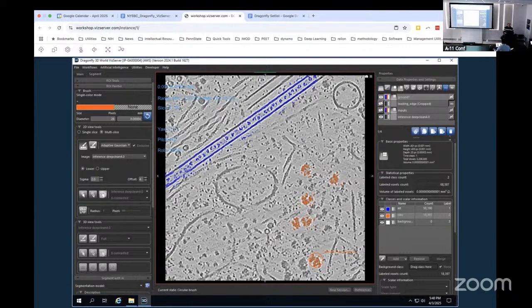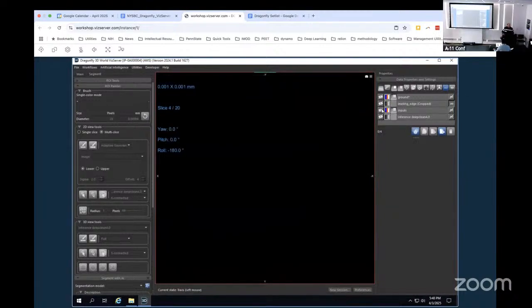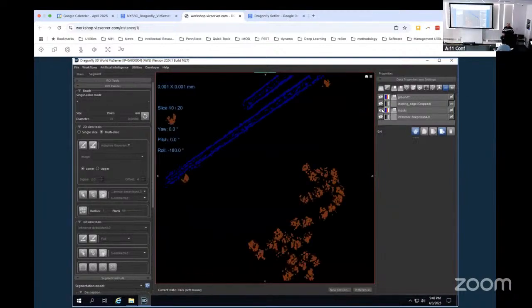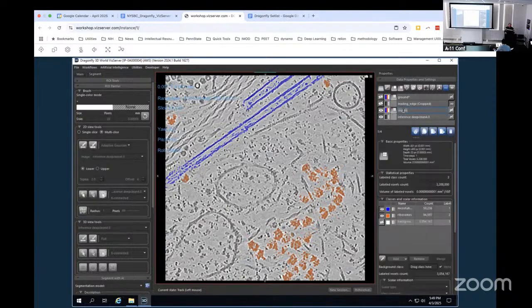What we'll look at here is there's one called inputs. So if you leave the tomogram on, when we open the training data, I don't know if everyone opened it. Do you all have inputs there? Sorry, I called it that. It was late. It should say ground or output. I'm going to call it output.